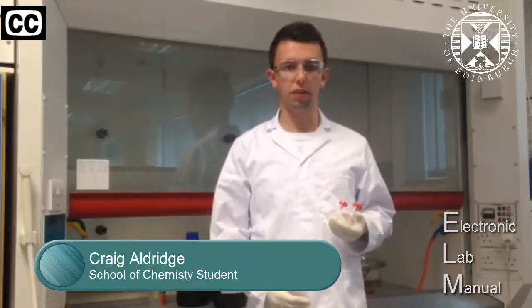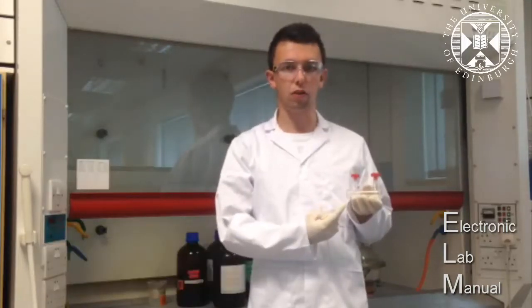Welcome to this pre-lab video for experiment 1. This is a short tutorial to demonstrate how to set up the gas cell, which is this here, to be able to record an IR spectrum.